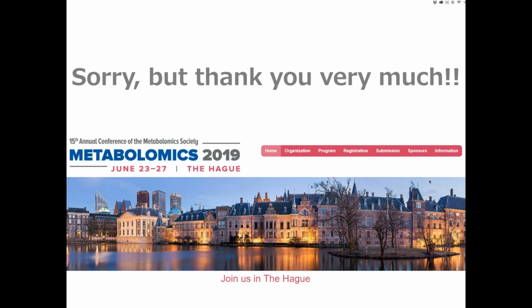Hi, Elena. I think I will start with a couple of questions that are already in the chat box. The question is from Santosh Kumar, and he asks, do you need both positive and negative ion mode for MS-DIAL to process the data? And also, do you need MS/MS of both the positive and negative ion mode? That's his first question.